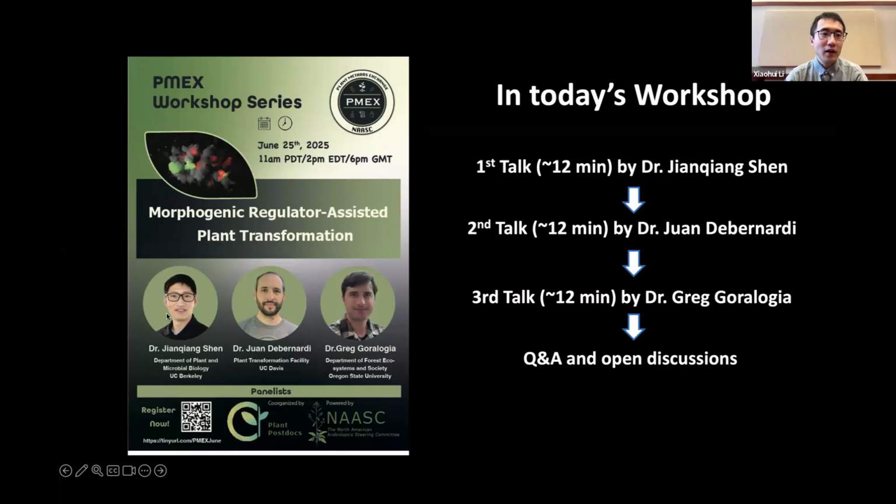Our next question is toward Juan. Can you elaborate on the utility and limitations of the inducible GR-DEX system for the purpose of regenerating normal plants? Is DEX toxic to some species in tissue culture?